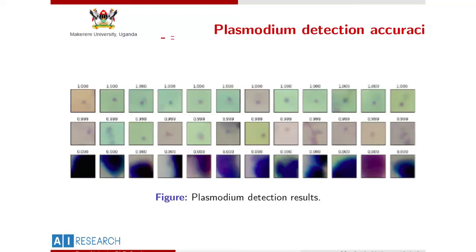The reason we use deep learning for this kind of analysis is that we don't want to get into the hassle of doing hand-engineered features. Deep learning has a learning feature of its own where it can learn the morphology of the pathogens that we're looking for, then return analytics on that kind of data. So we have two implementations for this.